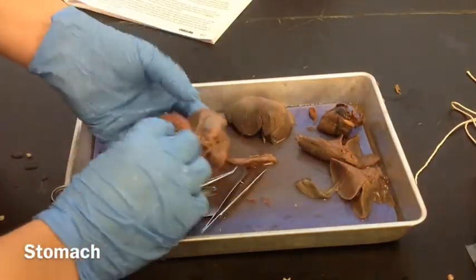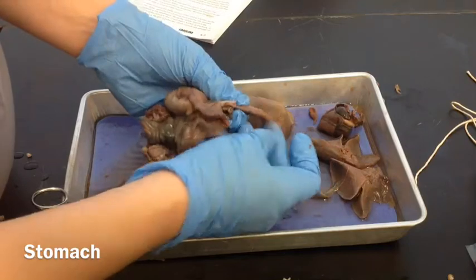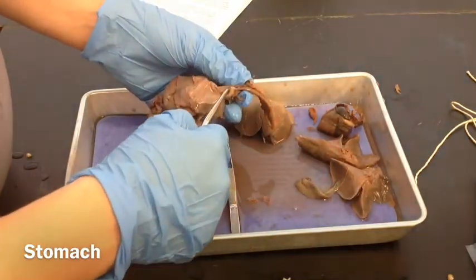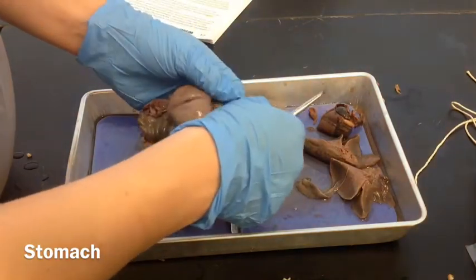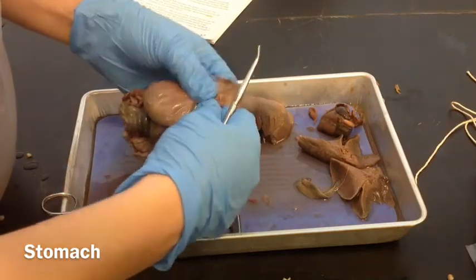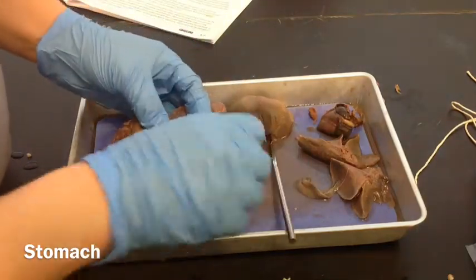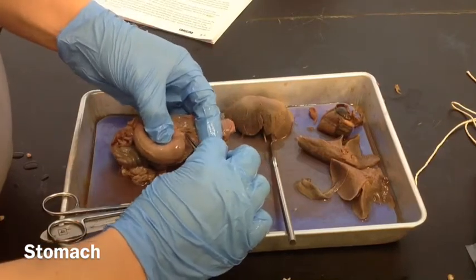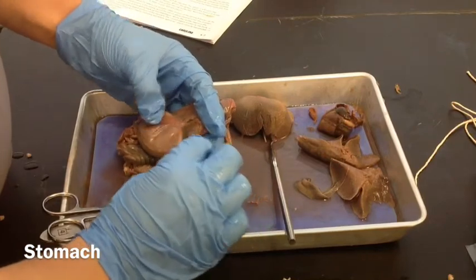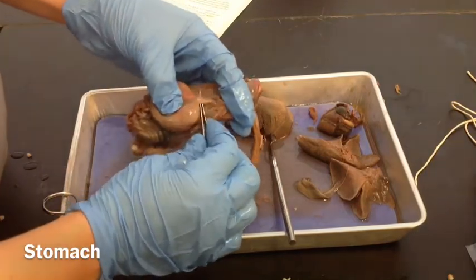Next we want to find the esophagus again. Remember, the esophagus was behind the trachea — this is the trachea, and the esophagus is that tube right there behind it. We want to follow it all the way down to the stomach. It goes past the diaphragm right there and goes into the stomach right there. If we pull some of that connective tissue away, you can see where it goes into the stomach at the top. That's the esophagus going into the stomach right there.